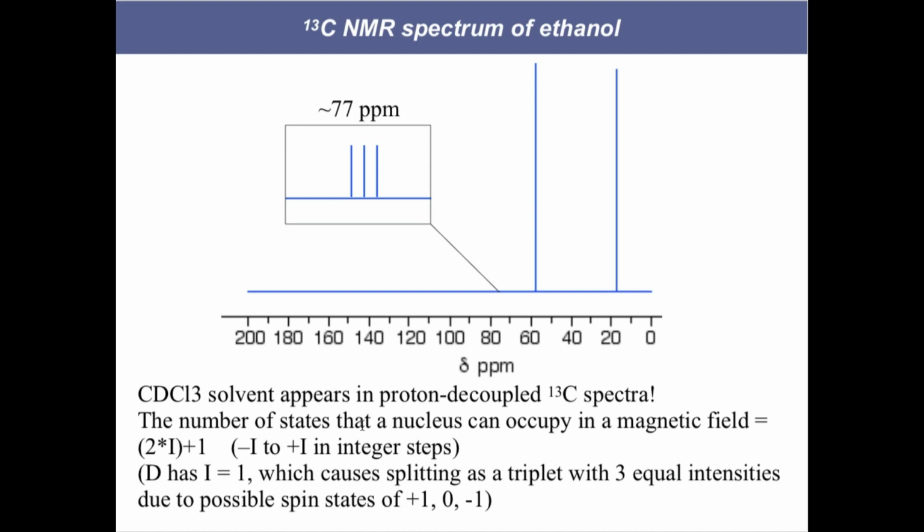And so since we take the spectrum in CDCl3, you will often see this triplet occurring at around 77 ppm. Right now, you don't see it there. It's probably been removed from the spectrum. But in the event that you ever do see it, that's all it is. It's just solvent. You don't need to worry about that.